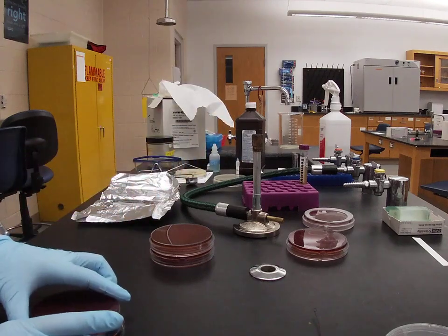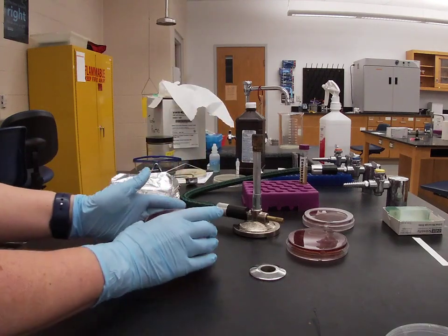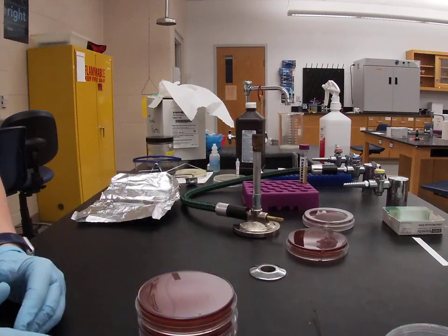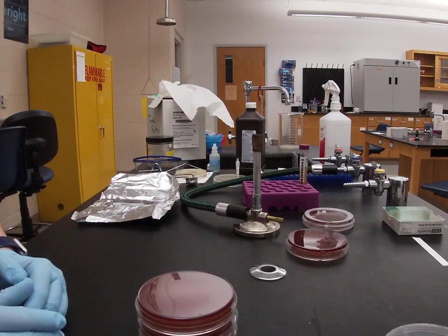And every type of organism that we work with this semester will display some type of hemolysis. And in some cases, the kind of hemolysis that you see is very important in the identification of that organism.